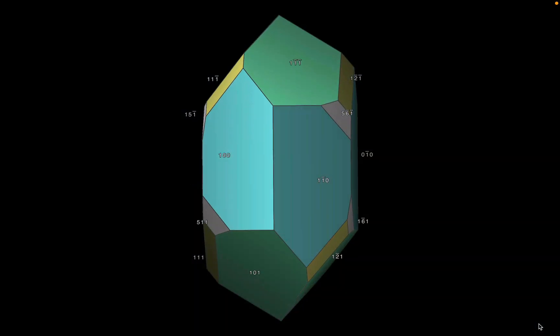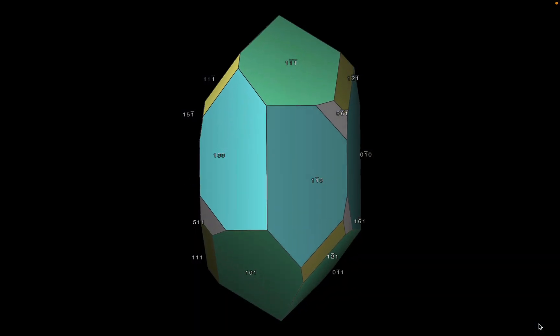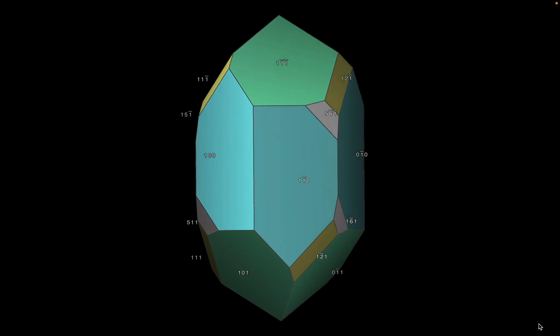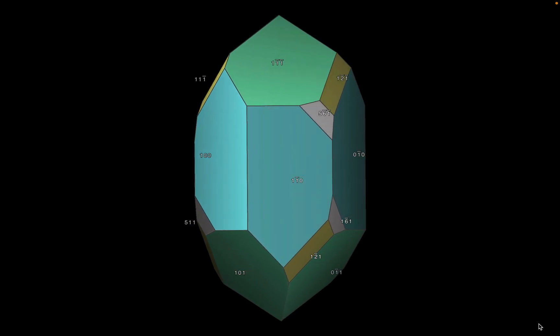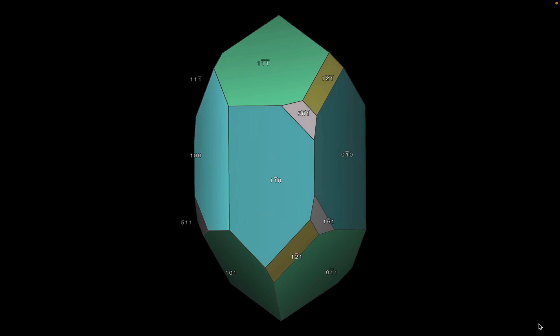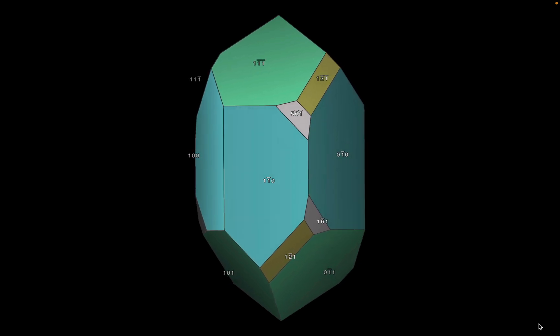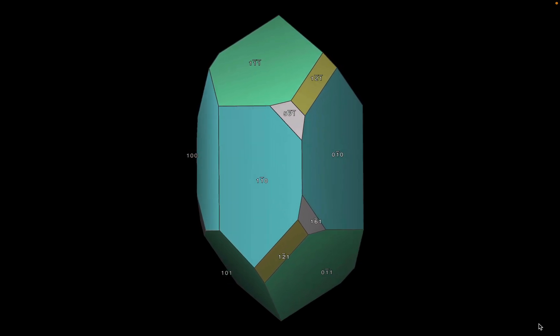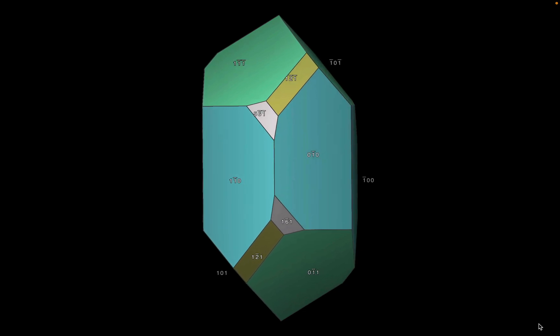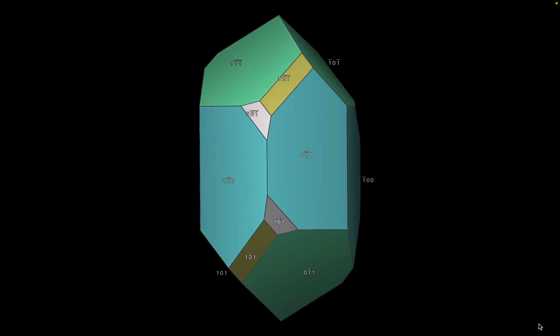In this short tutorial, we've built a crystal of right-handed quartz. Edited its morphology and colors. Annotated it. Compared it with its stereographic projection. And made some measurements.